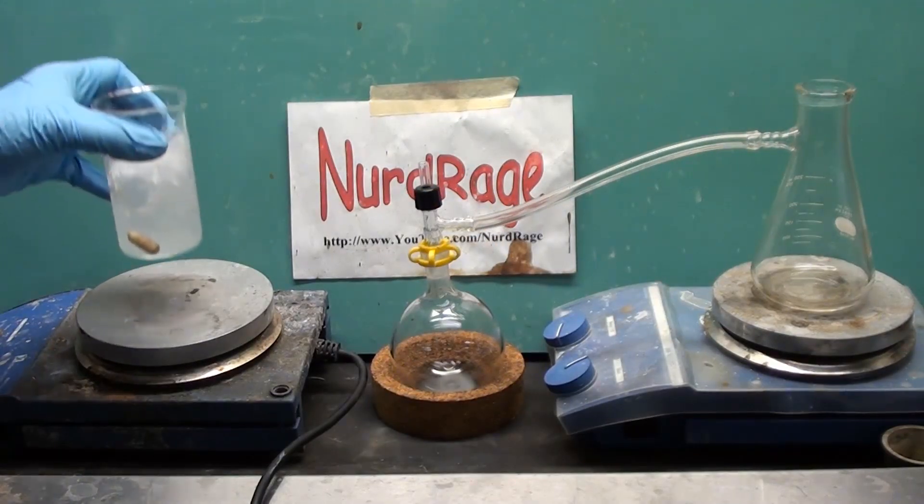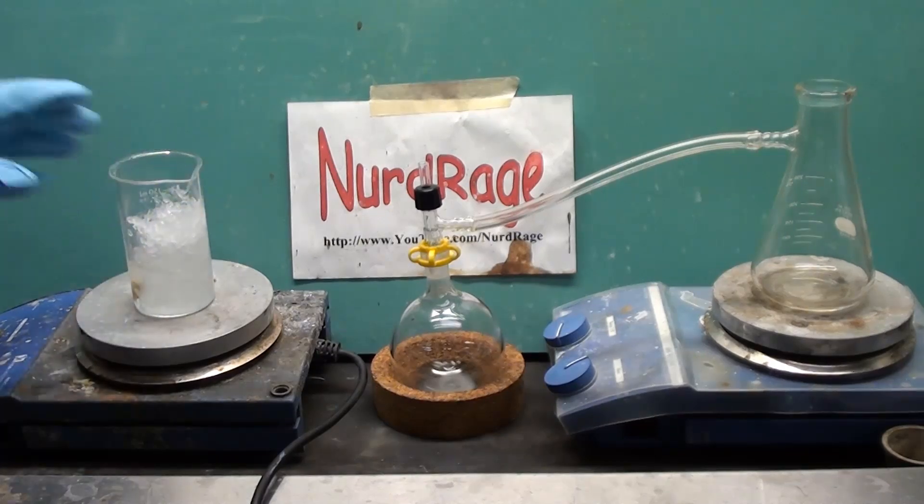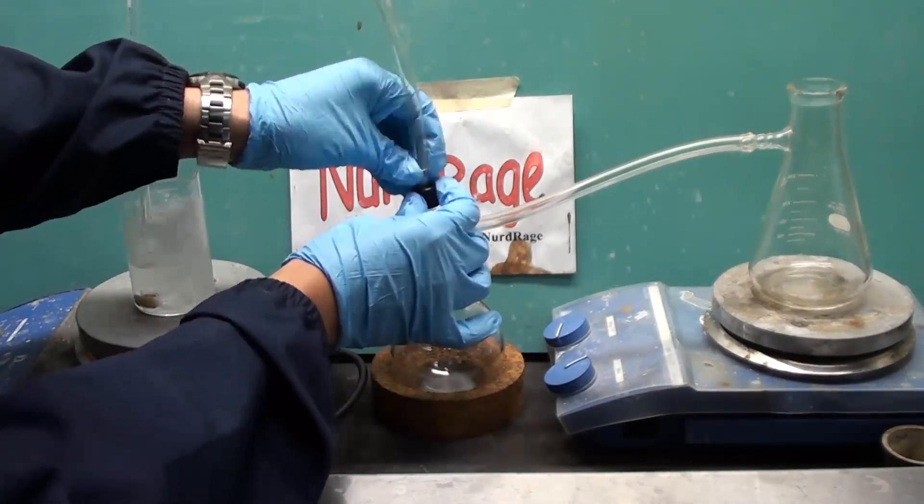Here we have about 100mL of crushed ice that will dissolve the hydrogen chloride gas to make hydrochloric acid. You can use less ice to get higher concentrations of hydrochloric acid. Let me connect up the gas feed tube.